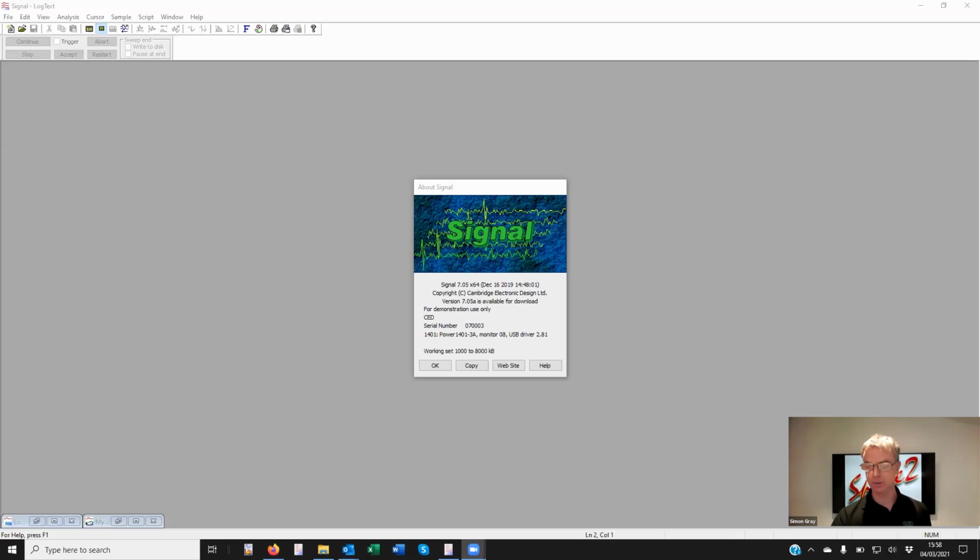This is advanced sampling, following on from the sampling talk that Simon Gray did a couple of weeks ago. I'm going to be using version 7.05, which is the very latest one available for download on the website. There will be a 7.06 coming out hopefully next week. Keep an eye out for that.